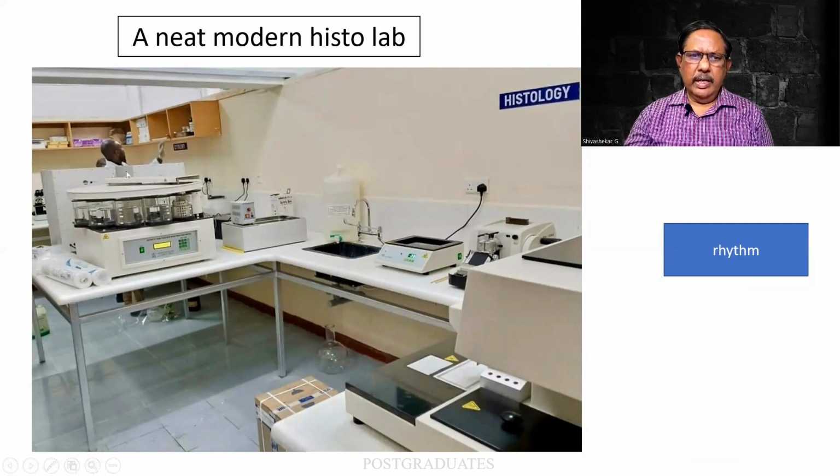There is a machine called the histokinette. The processing is going on, after which I find that there is a water bath and other things. Section cutting is going to go on at this station, and probably there is something called the hot and the cold. Probably there will be embedding going on, and finally you get the slide out.